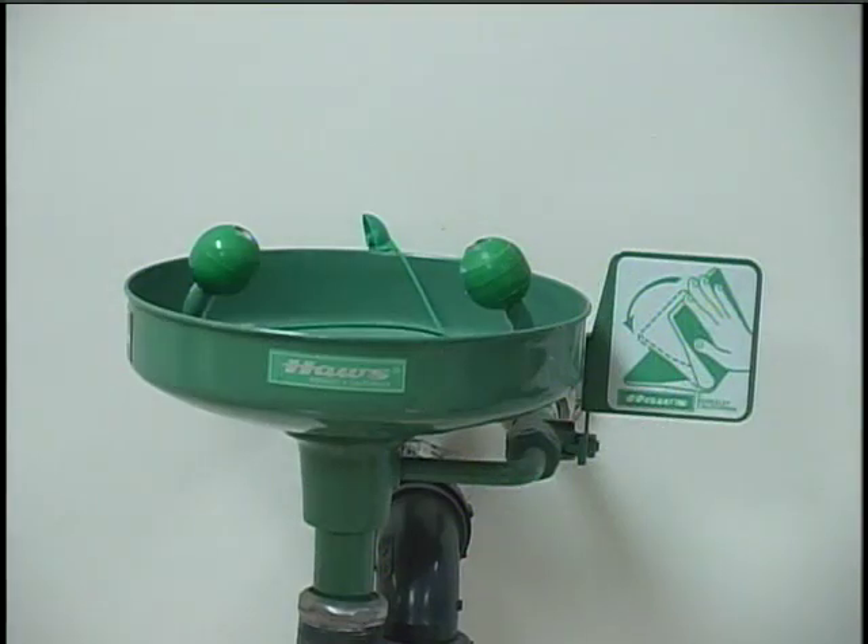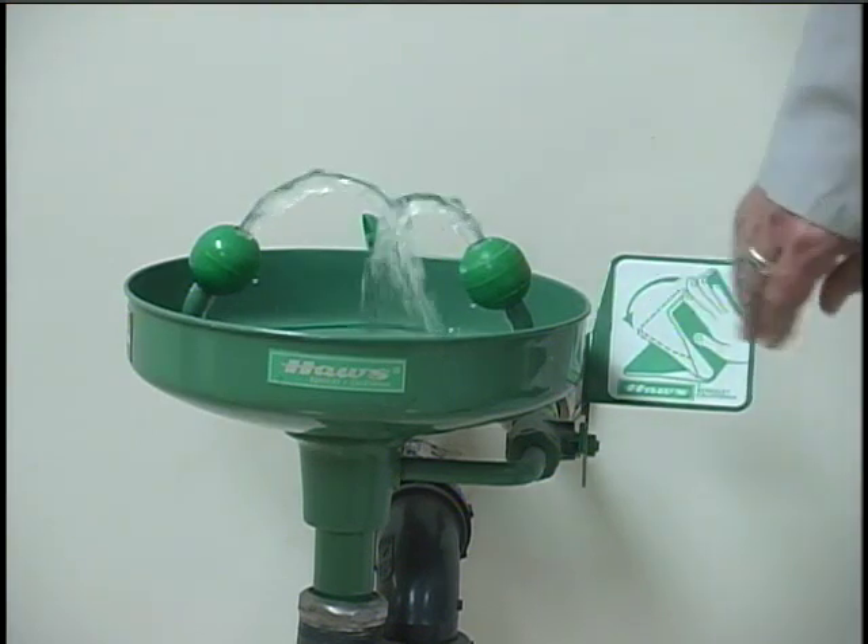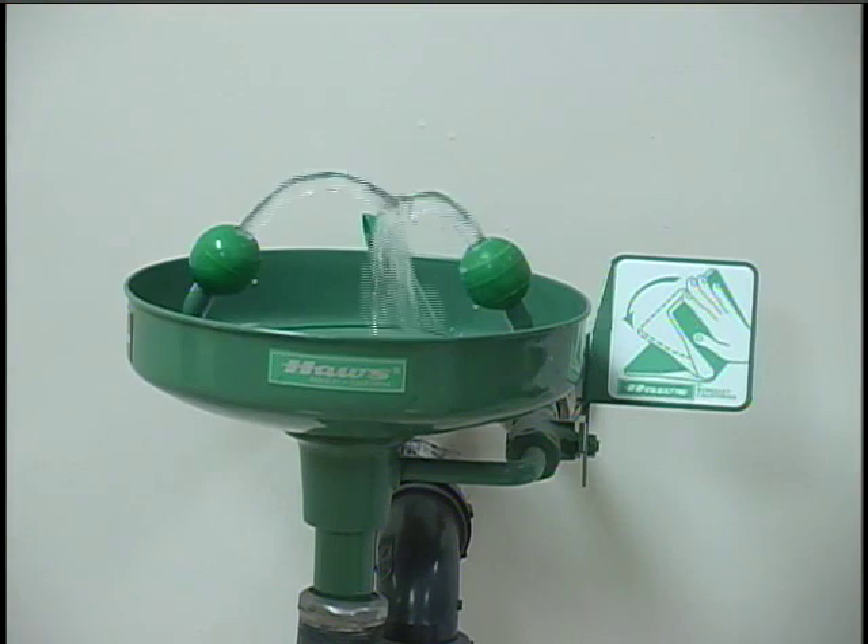We'll start out by looking at the emergency eyewash. You would use this in case you got some nasty chemical in your eye and needed to flush it out. There is a sign telling you where the eyewash is, but if you've got a chemical in your eye you're not likely to be able to read that sign very well, so you want to know exactly where the eyewash is in the lab. To use it, simply push the bar forward to start the flow of water. Use your fingers to hold your eyelids open in the water stream and flush your eyes until all the chemical traces are gone.